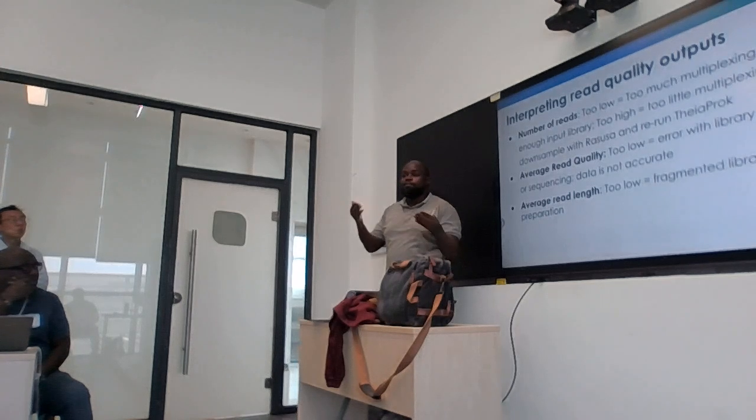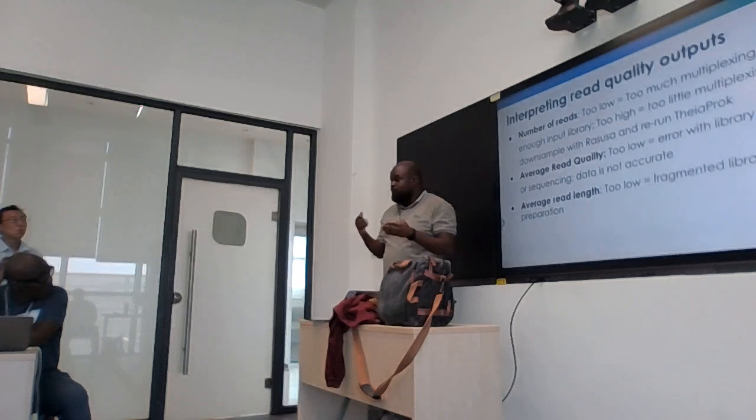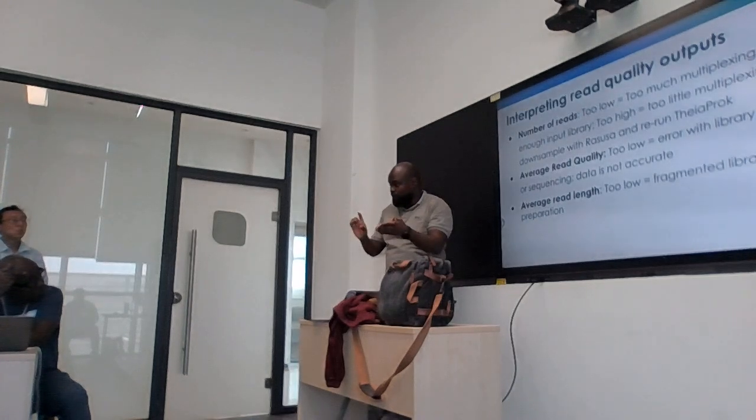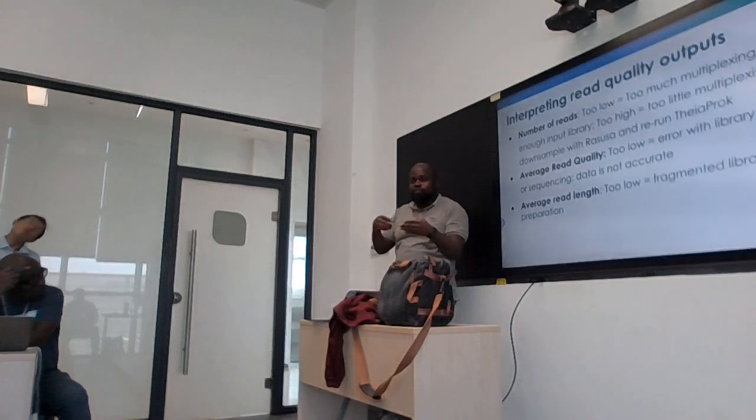And you see, this is what typically happens in the lab. Even in the lab, you always have to optimize your sequencing. You do a run, maybe you say, okay, I'm going to do 48. You see the number of reads and the quality that you get, right? Maybe you do another sequencing, you do 64. You see how the depth and all these things change.